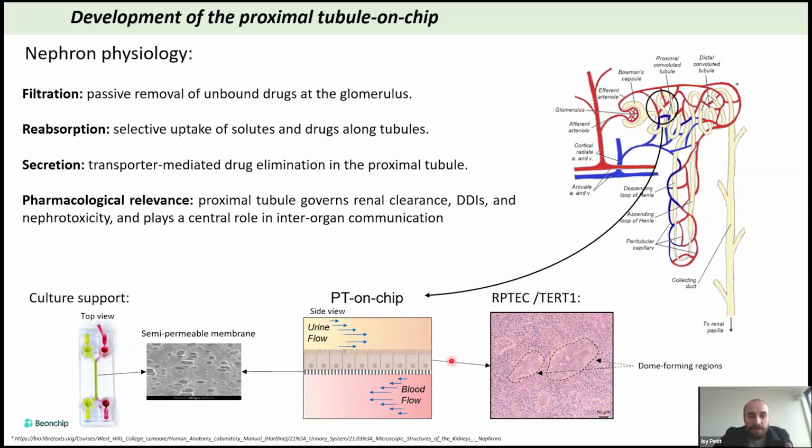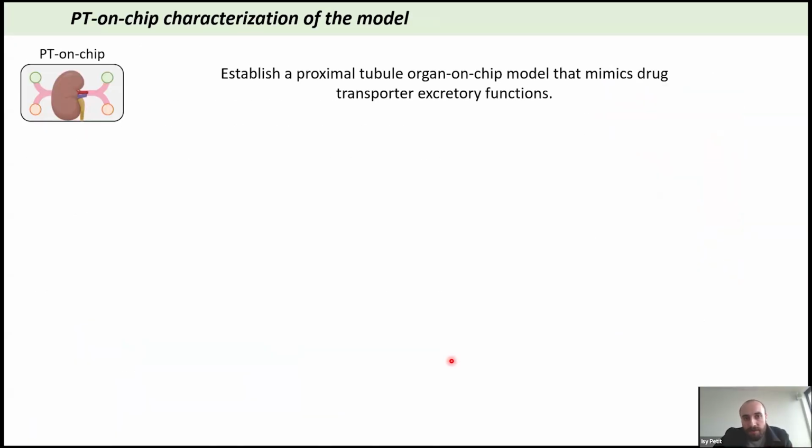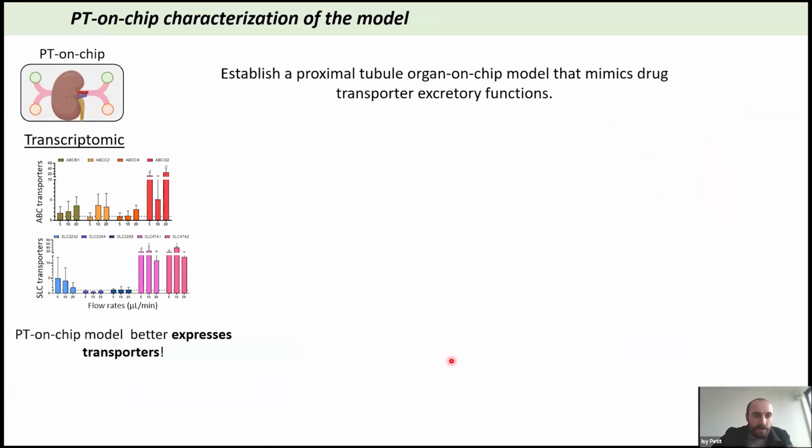So we would like to establish a proximal tubular organ-on-chip model that mimics drug transporter excretory function.